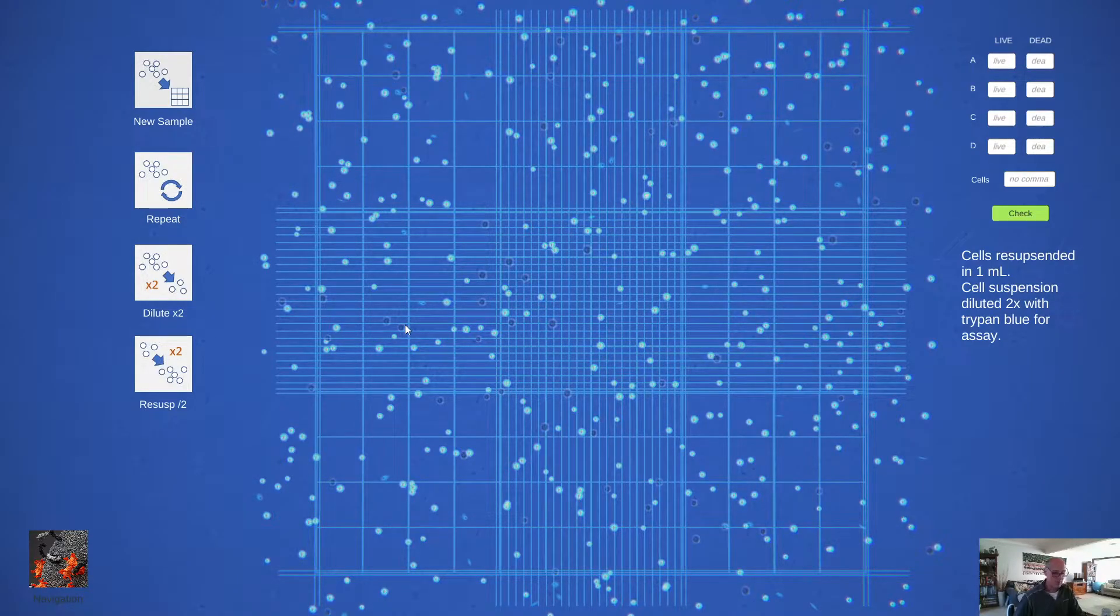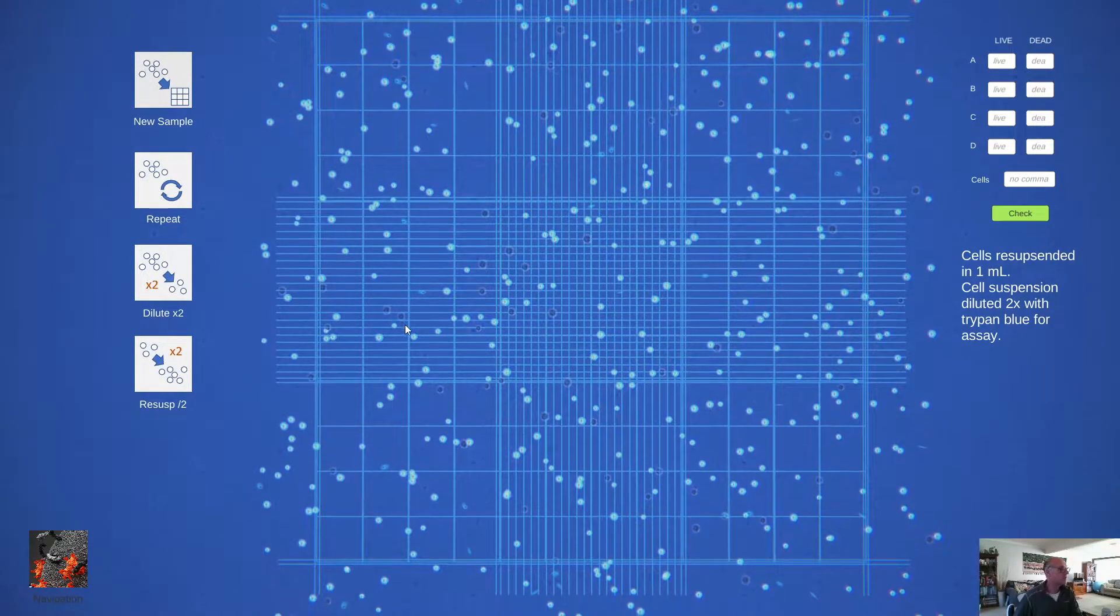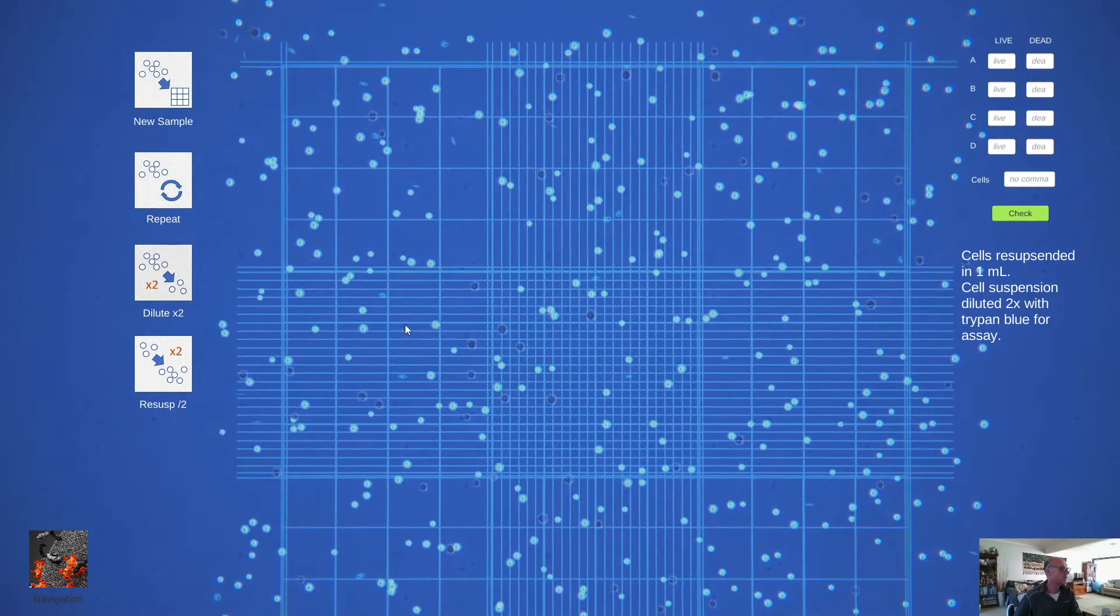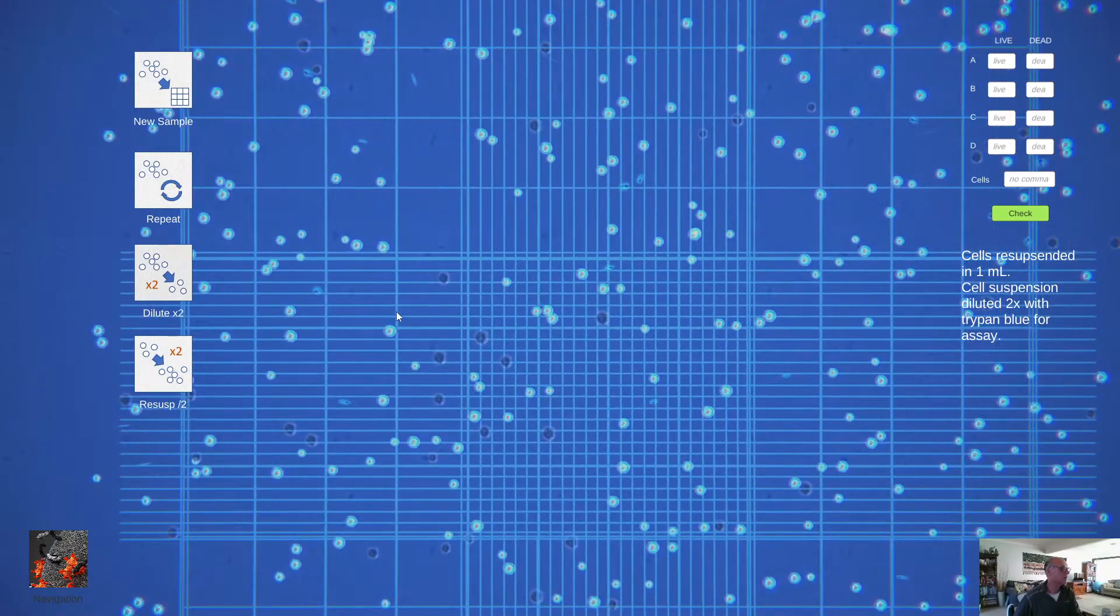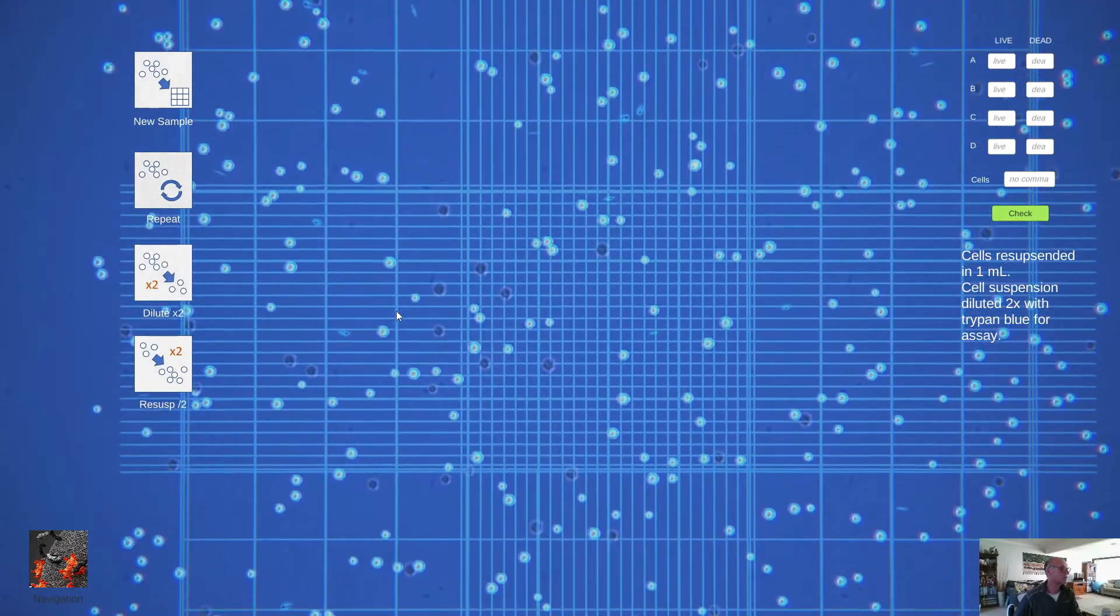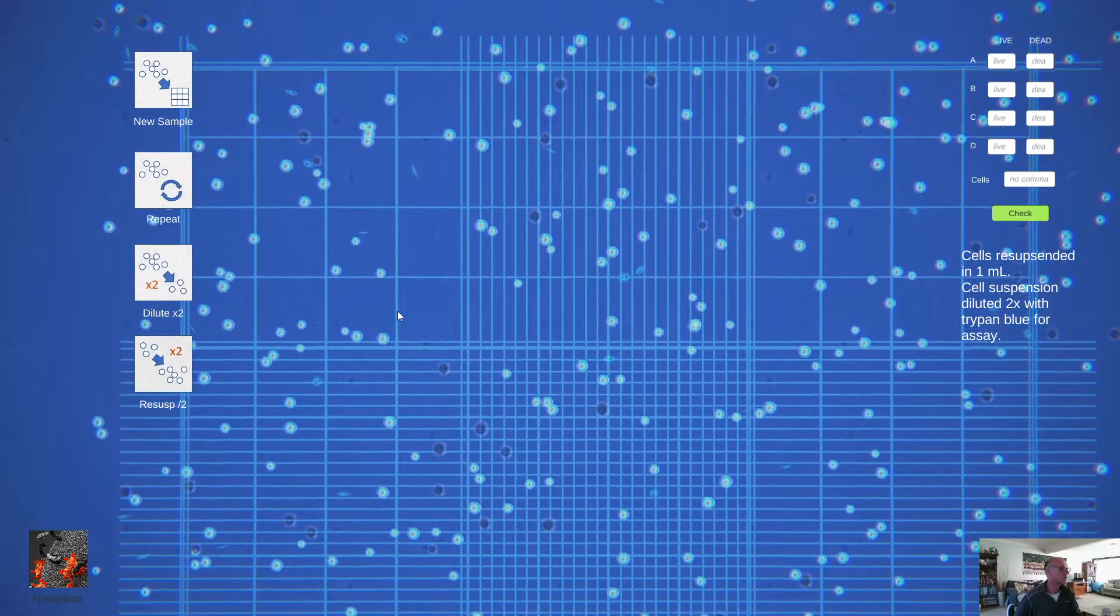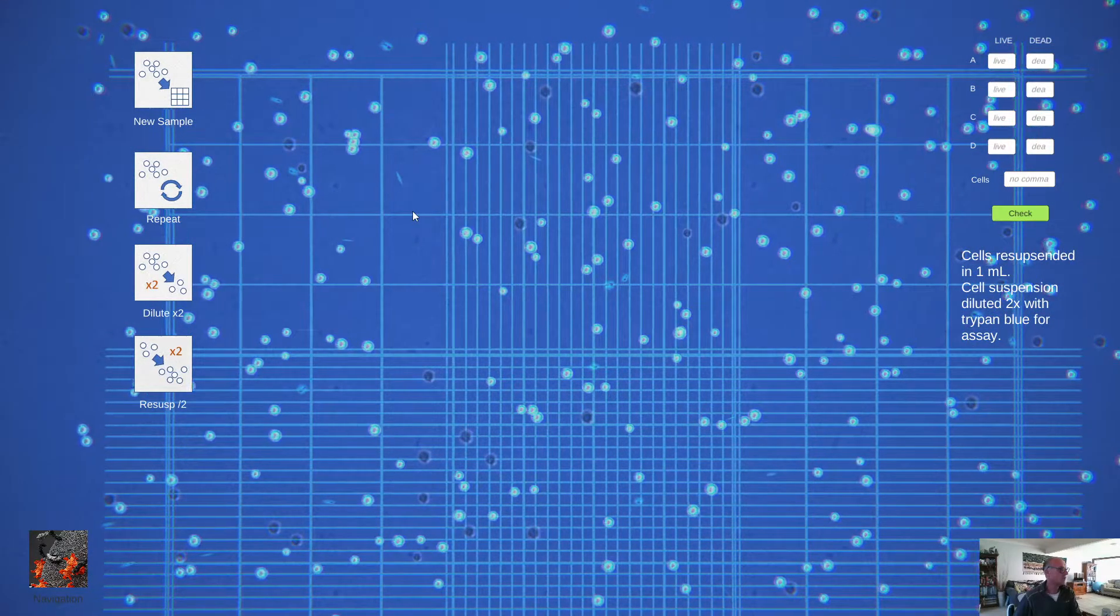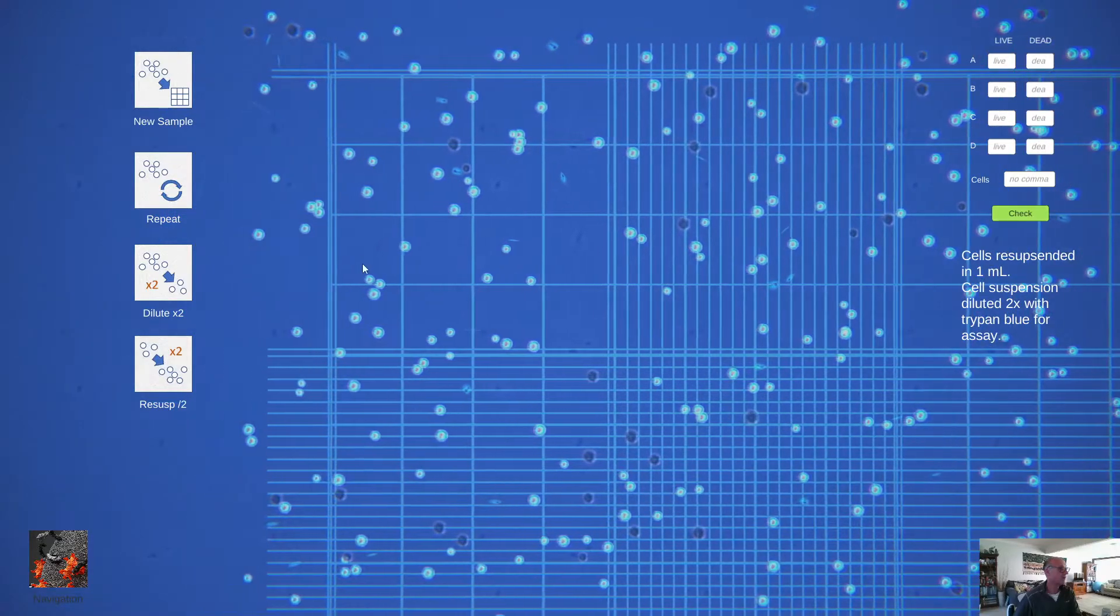We can zoom in and look at particular sections of this so we can really get to grips with what's happening at the goal line.